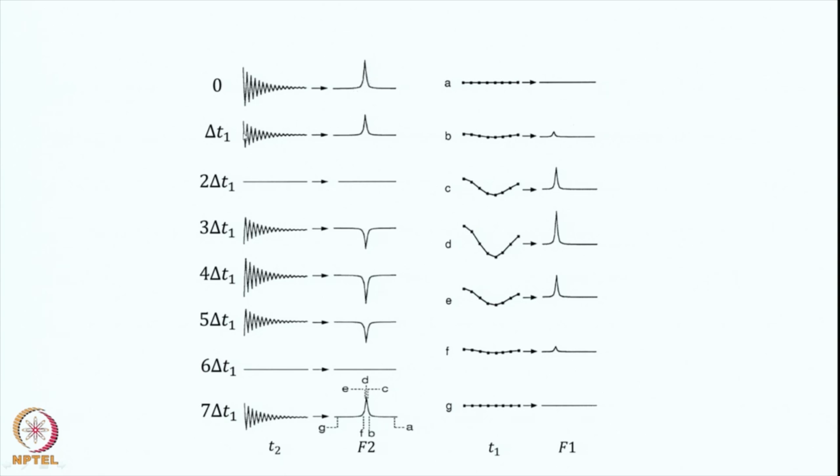Now the second one, you notice the first data point, the intensity is reduced. Therefore, if it were a single line spectrum, it would produce a line with a reduced intensity because the intensity is reduced here. If you remember correctly, the first data point is the integral of the spectrum. F of 0 is the integral of the spectrum. We discussed this in Fourier transform NMR. F of 0 is equal to the integral of F(w) dw, right. So whatever is the initial point here, that is what you will get in this one.